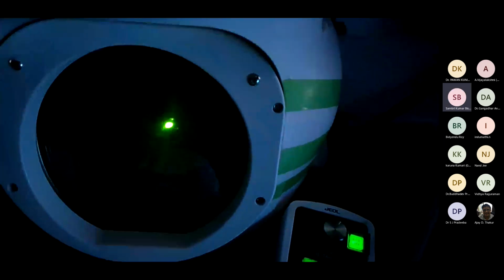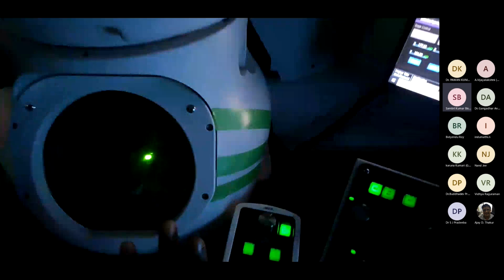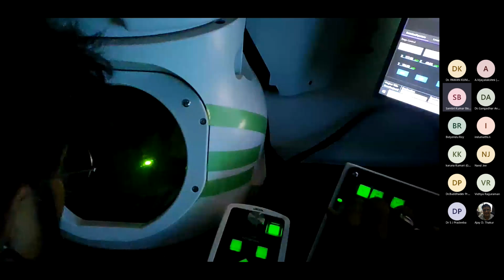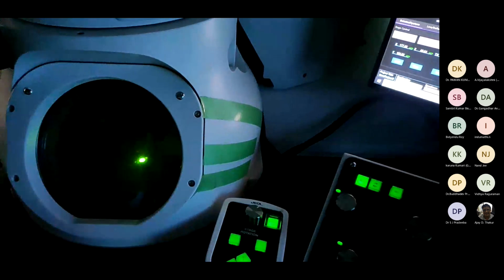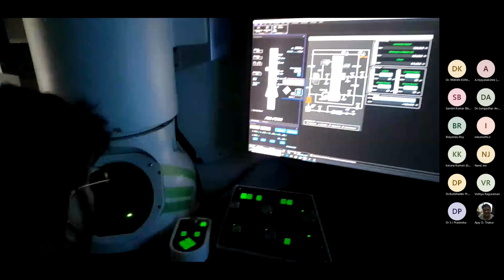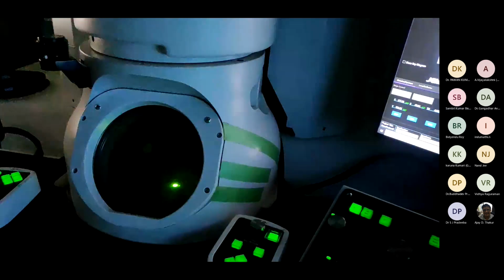So I'm just focusing the beam, this electron beam, at the center. Okay, so this is what I'm doing actually. So right now by moving the XY, I can move our electron beam. Right now the beam is focused on this black spot, which is at the center of this fluorescent screen. It means the beam is at the center. Okay, so I'll set the standard focus. Further, I'll do the image wobbling and HT wobbling.